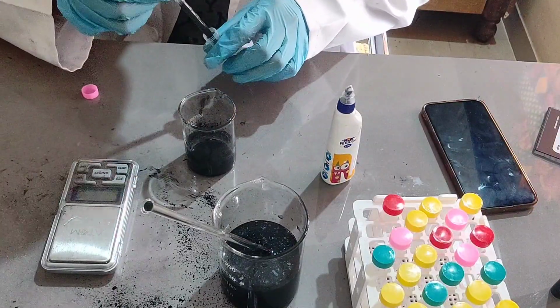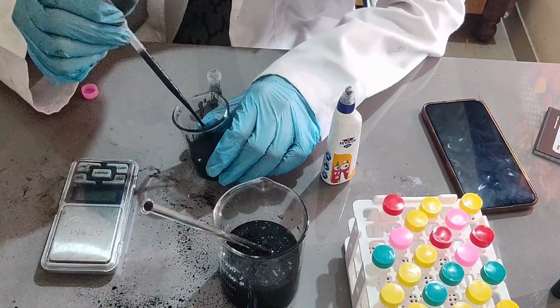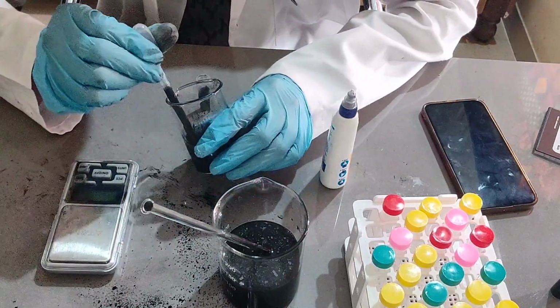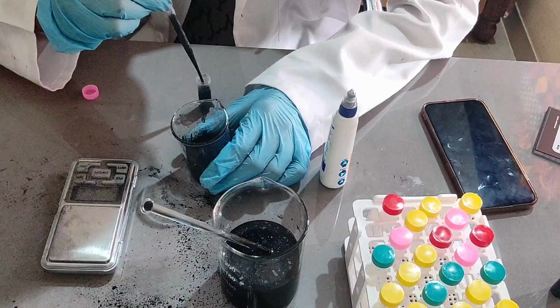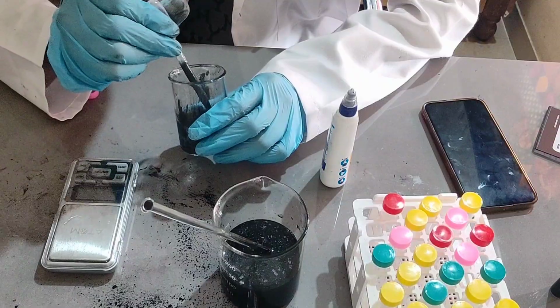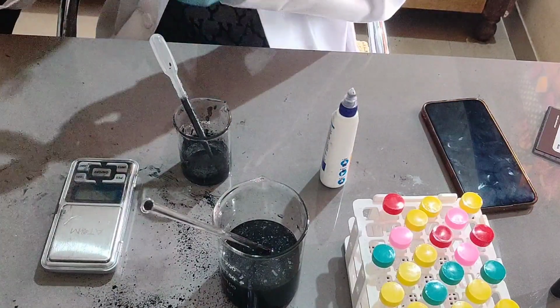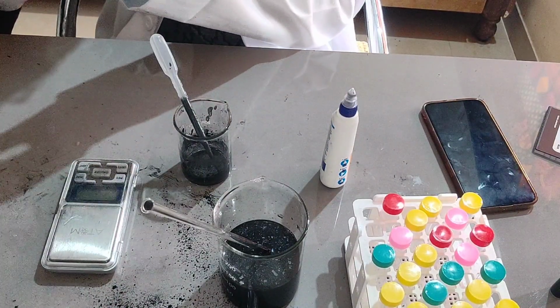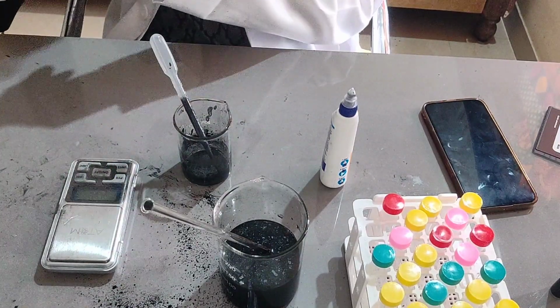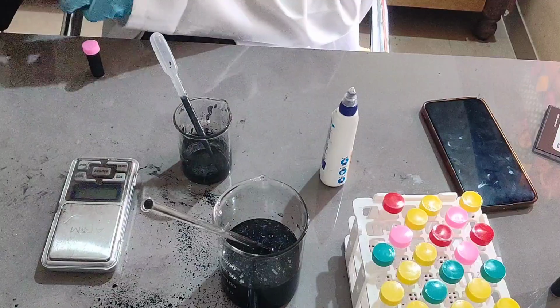Take a little bit. Take a little more. Mark it.